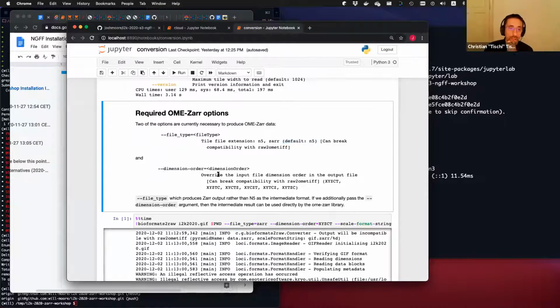George? Yes? Just a short question. So this bioformats to raw, within Java or within Python, does that also exist or not as easily? So bioformats to raw is written in Java, so you can use it from your Java code. If you were working from Python, then I would probably point you to Jamie from AICS Image.io, and I'll let him talk about that if he wants.